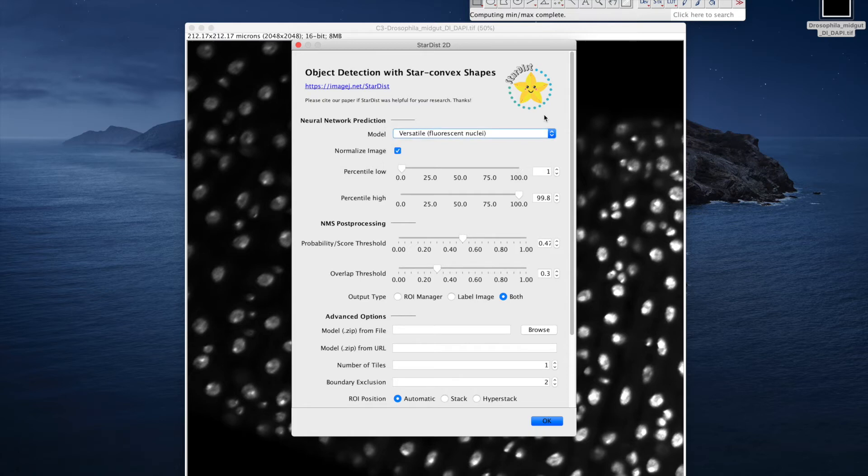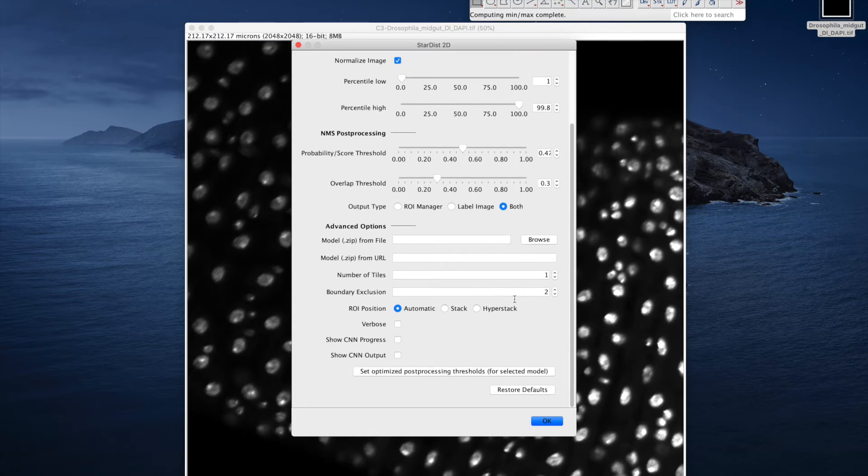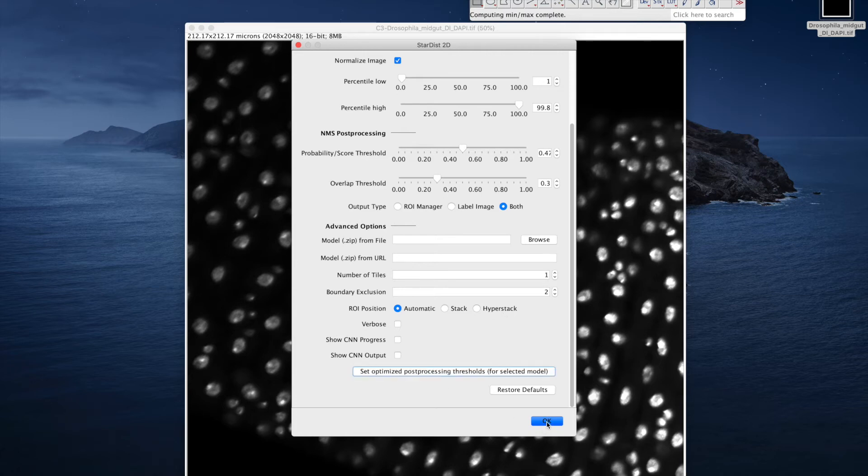Here I will go with the versatile fluorescent nuclear model and click the Set Optimize Post-processing Thresholds button and hit OK.